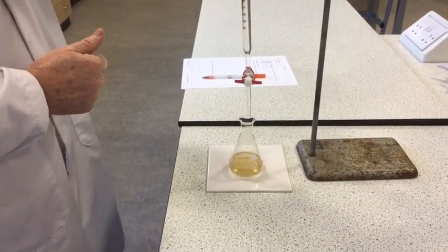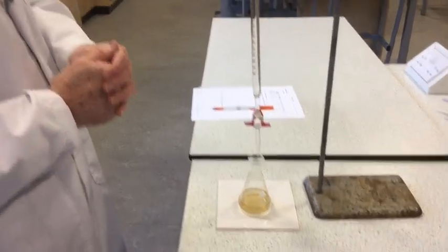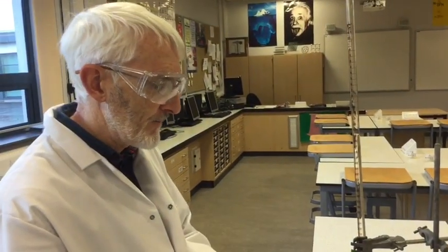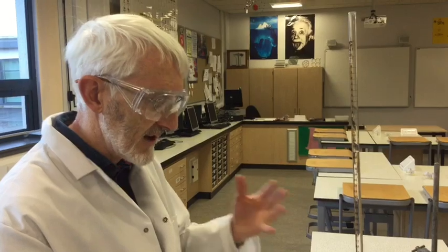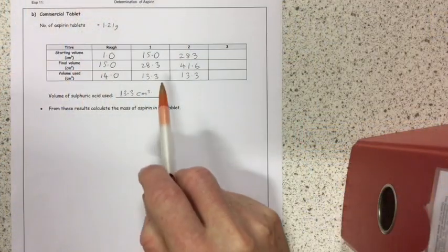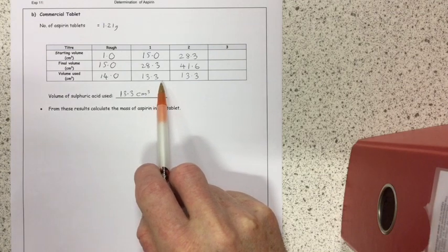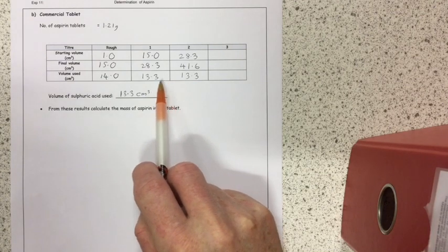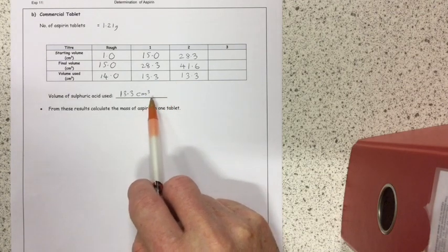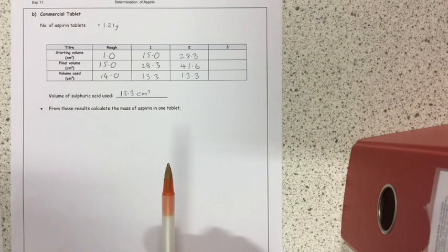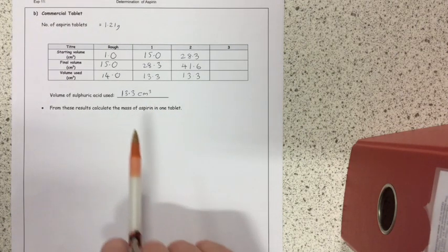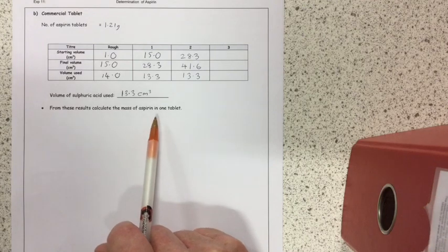I now repeat that two, three, four times until I get concordant results doing accurate titrations, so that's two readings within 0.1 cubic centimeter of each other. My first two accurate titrations both gave me a volume of 13.3, so that will be the volume of sulfuric acid that I'll use in the calculation to determine the mass of aspirin in one tablet.